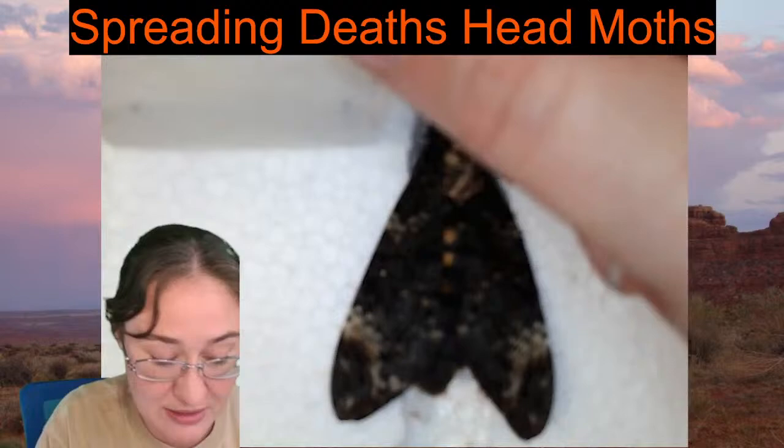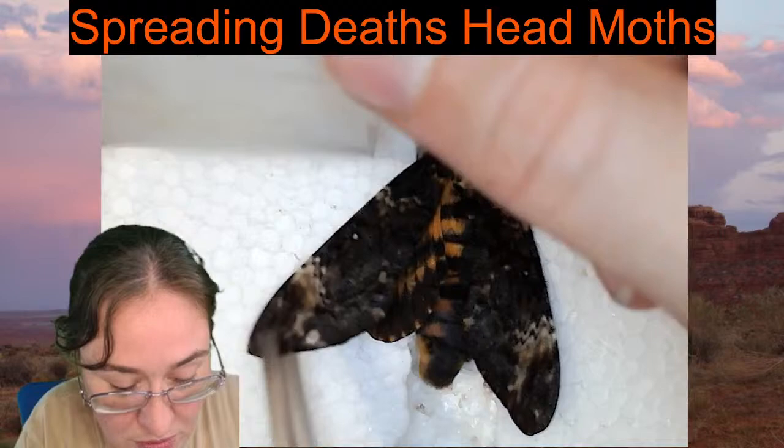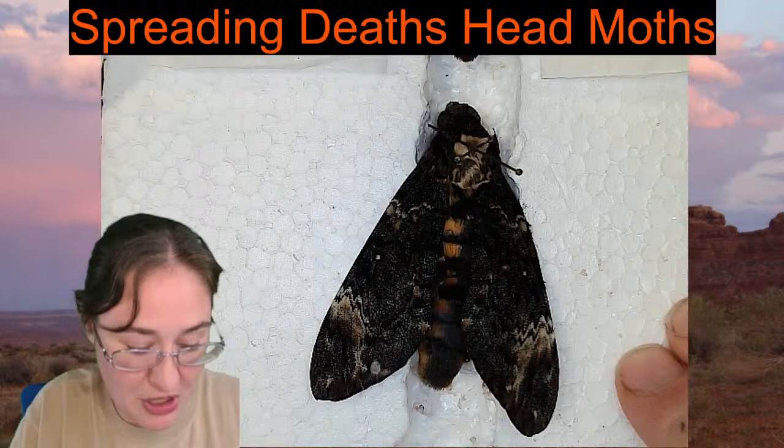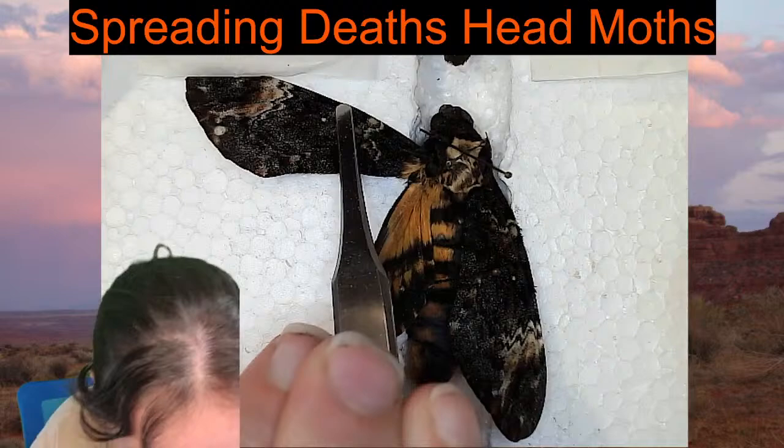Now, I'm going to go ahead and take this wing using my forceps and pull it up. Oh, no, I put these too close. We're just going to put it off to the side for now. We have about 5 minutes to get this moth spread and on the board so that we can start our normally scheduled sketch at 10.